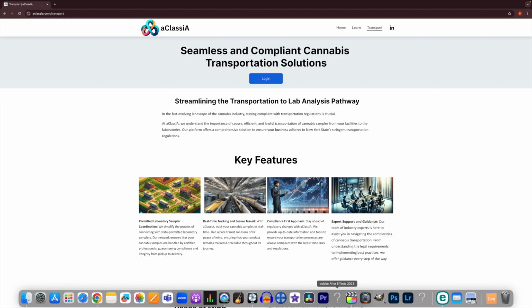Welcome to aClassiA, New York's only document management system that streamlines the laboratory transport process. In our first short video, we learned how to originate an order using aClassiA. In this video, we will review how a permitted laboratory sampling firm will receive an order.